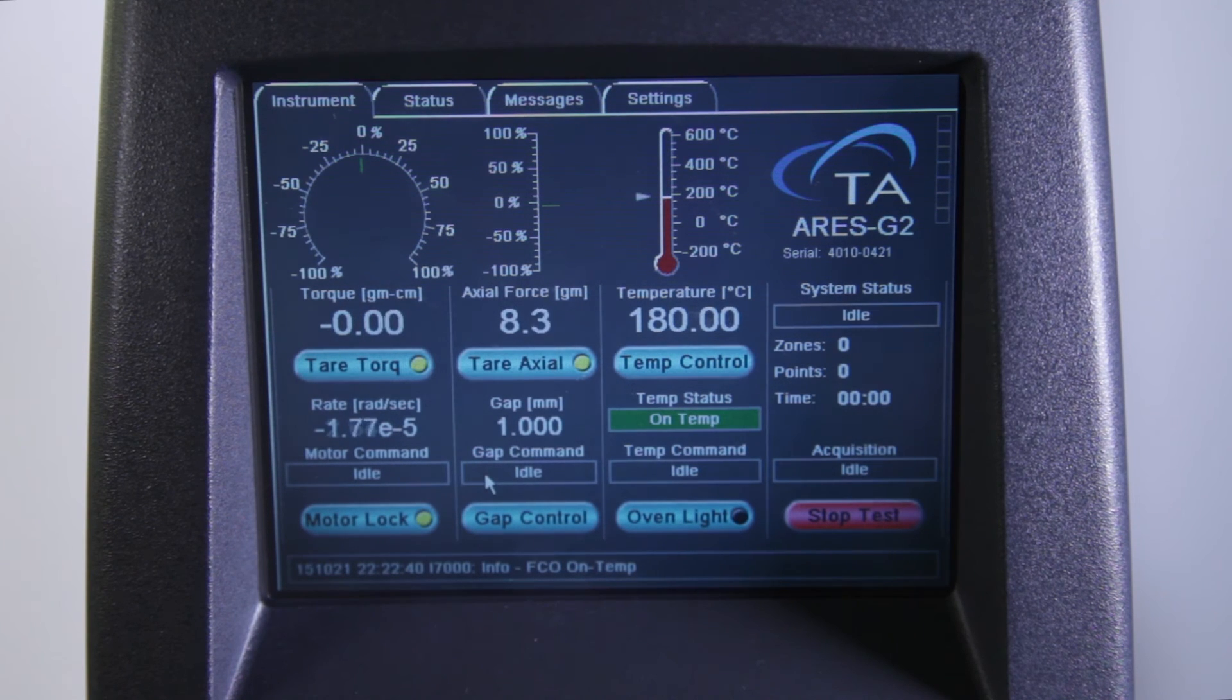At this point, the programmed experiment can be initiated. In this TA Tech Tip, we've demonstrated how to use the melt kit to load polymer pellets on the ARIES G2. Please stay tuned for more helpful TA Tech Tips. Thank you for your interest.